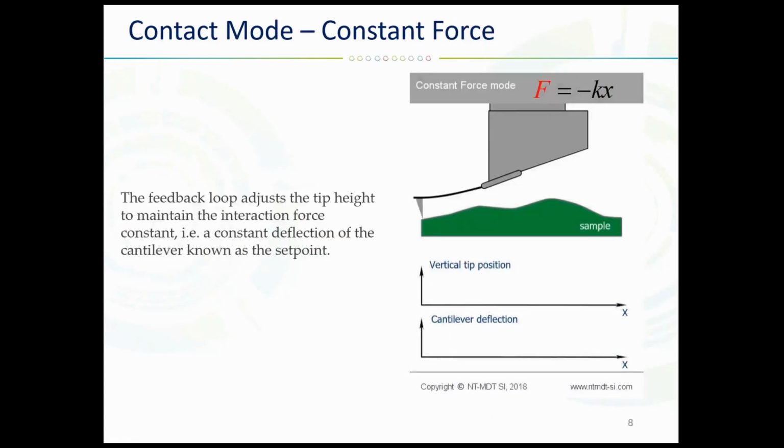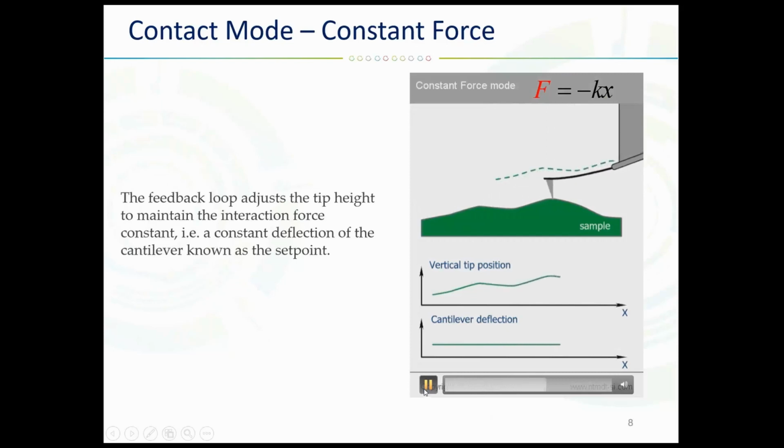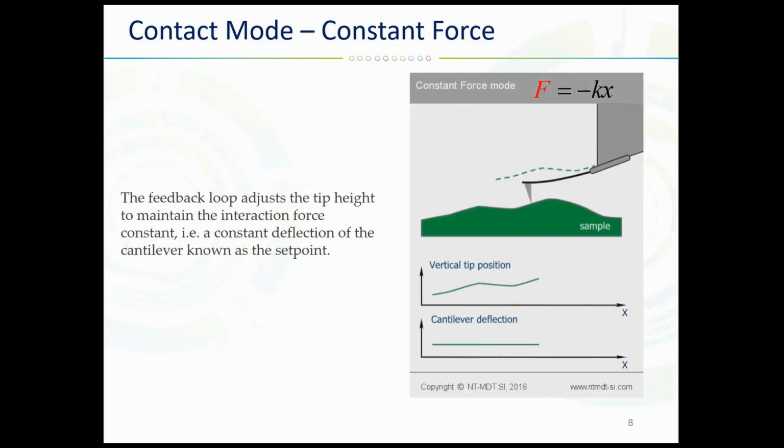And here is the constant force mode. The main advantage of the constant force mode is that it is possible to measure with very high resolution simultaneously for topography and some other characteristics, for example, friction force or spreading resistance and so on.